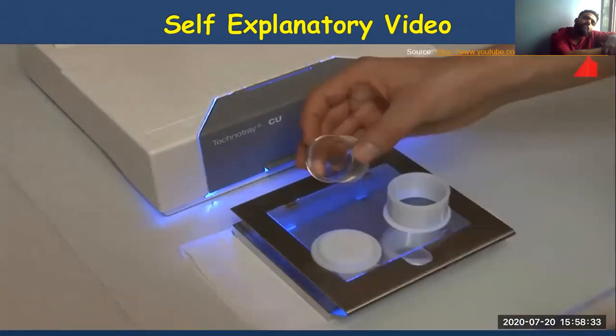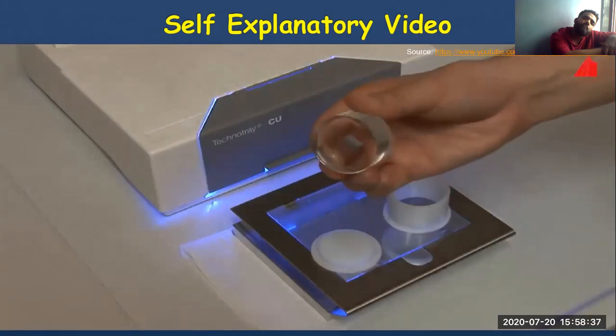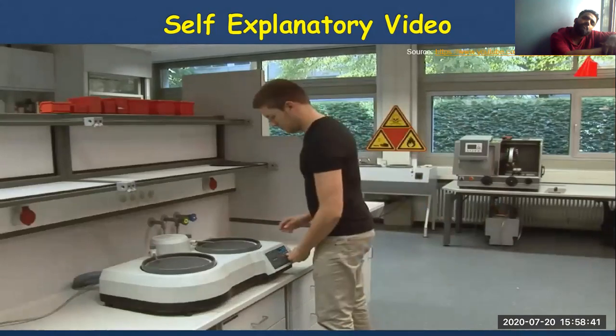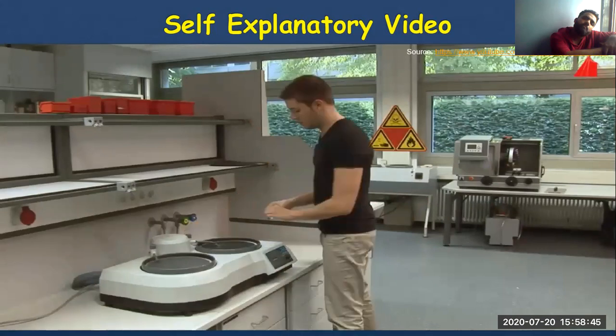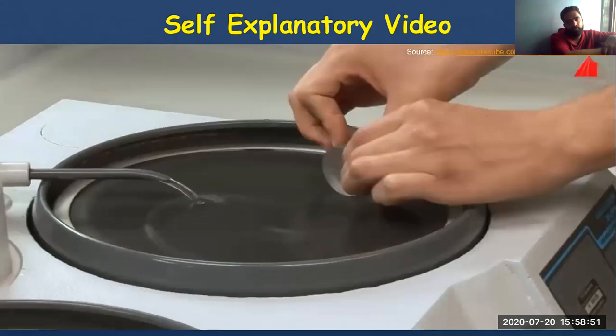Because the top surface is still uneven and slightly sticky, the material tester grinds it there until it is even. He uses a rotating water-lubricated disc equipped with coarse-grained silicon carbide paper. I hope you are able to understand. The surface is slightly ground as well to ensure a clean specimen.